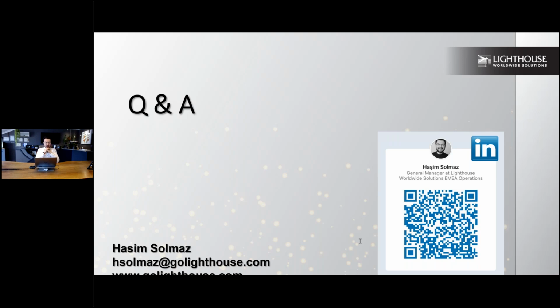Okay, one more question. Should recovery tests be performed for non-sterile areas such as the final blend room and corridor? Good question. A recovery test is for most of the clean room areas, not limited to sterile or non-sterile, because this recovery will tell you whether you have the highest risk or not.